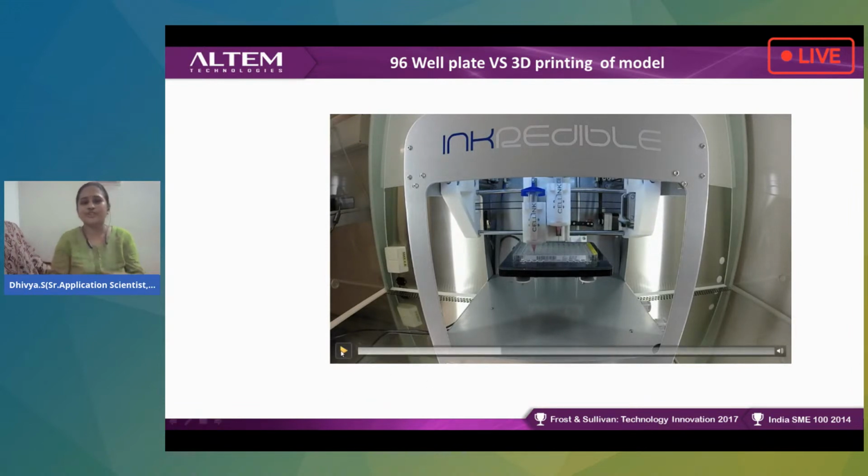If you look into it, for instance, say an assay that you want to perform, we used to take this 96-well plate and load it with pipettes, and we used to have lots of instruments around us. But one such machine is going to do all the work. That's how it's going to be automated and transitioning towards a new technology.